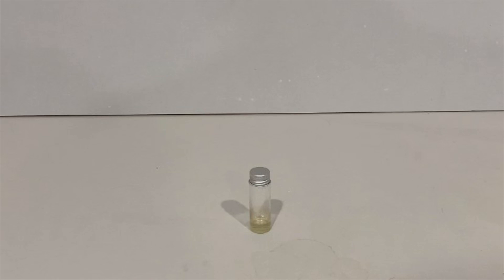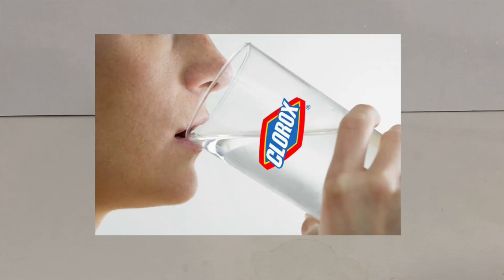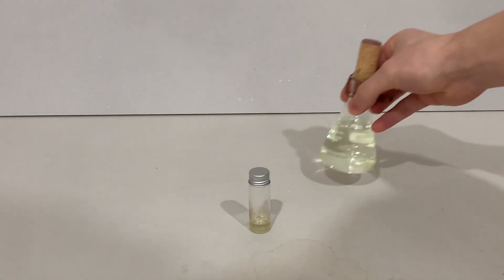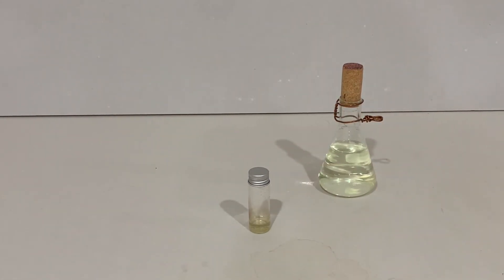I will also need a chemist's favorite drink on Valentine's Day — bleach — and an ice bath. The bleach is going to be used for the reaction, but why the ice bath? The ice bath is just to lower the temperature of the reaction.